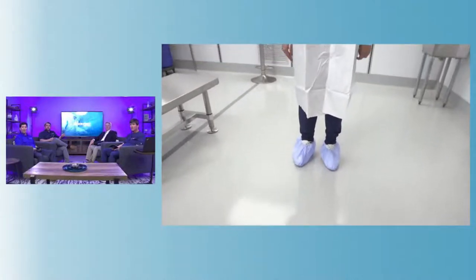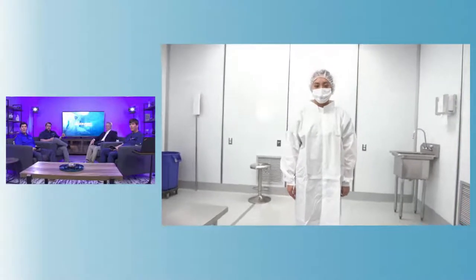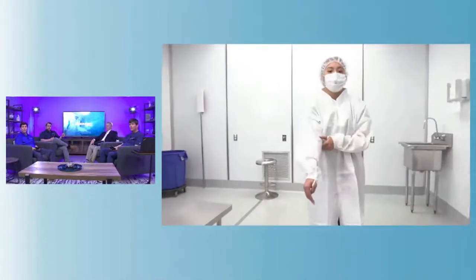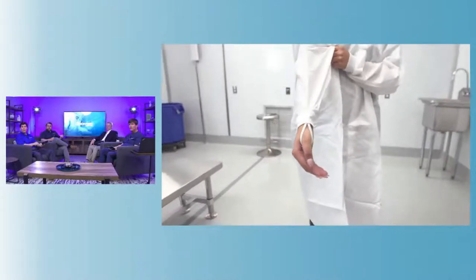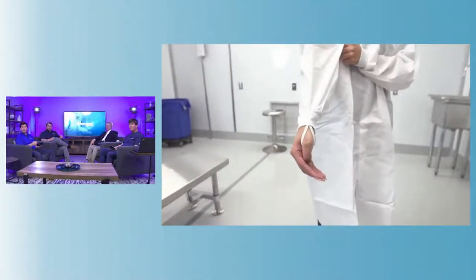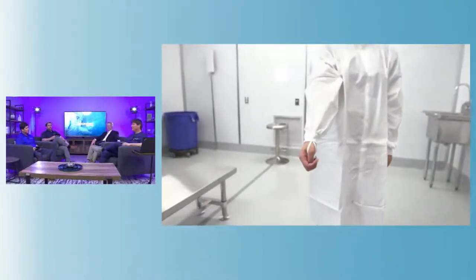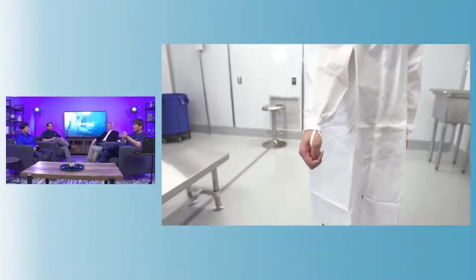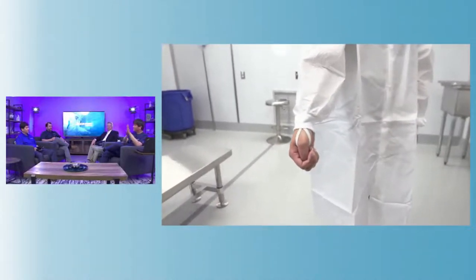So that's great. She's got the low generation particle gown on, and it also has thumb loops. So when you're donning your gloves, it's not going to ride up and give you any exposure between your wrist and your hand. That is a key feature, those thumb loops. Back in the day, they'd actually instruct people to take some scissors and cut the edge of the cuff of your gown so that you could slide your thumb through.